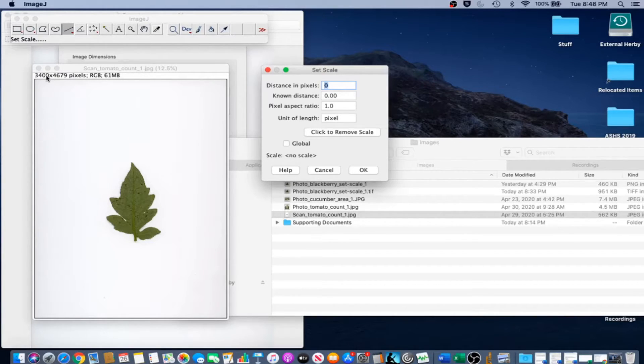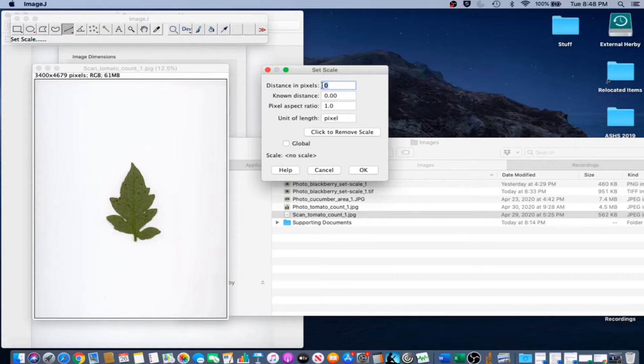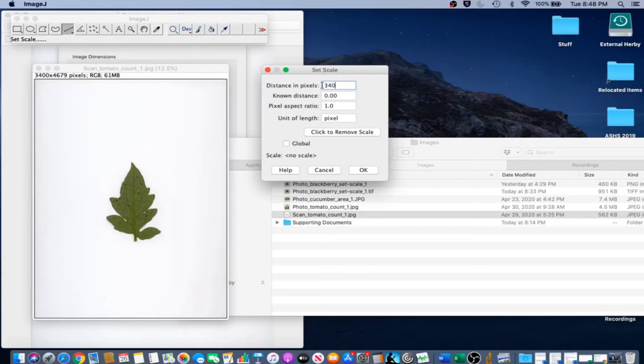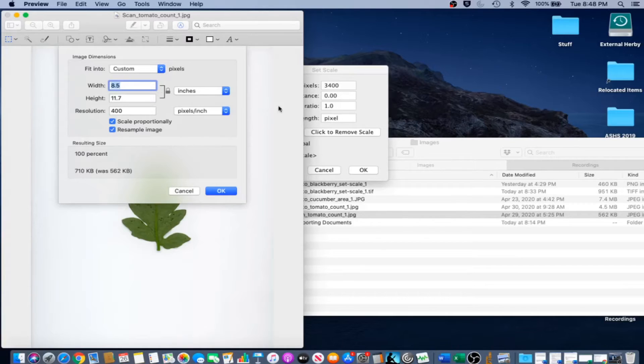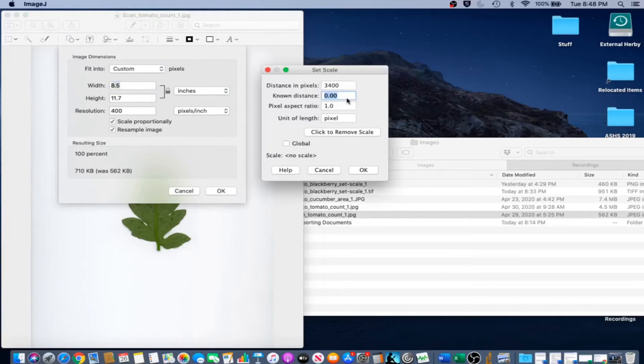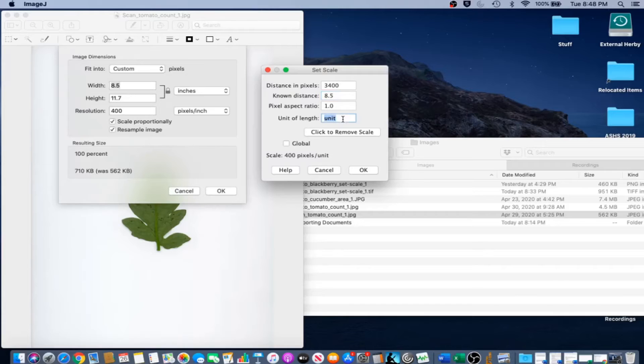Enter 3400 as the width of the image in the distance in pixels. And then go back to our preview page. We notice that the width of the image is 8.5 inches. We're going to put 8.5 and then fill inch for unit of length.